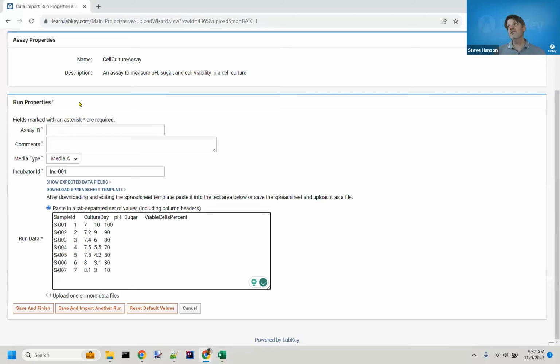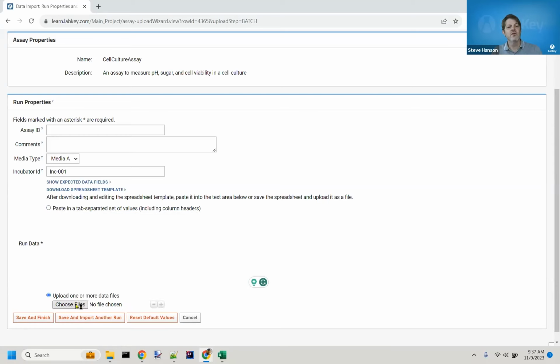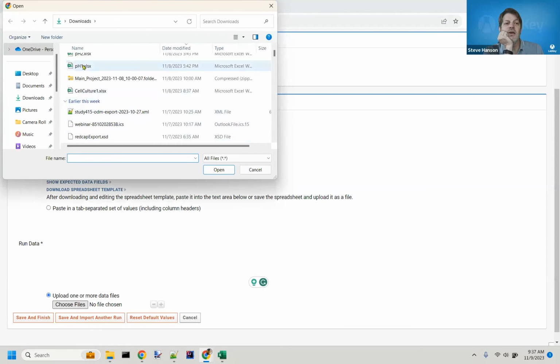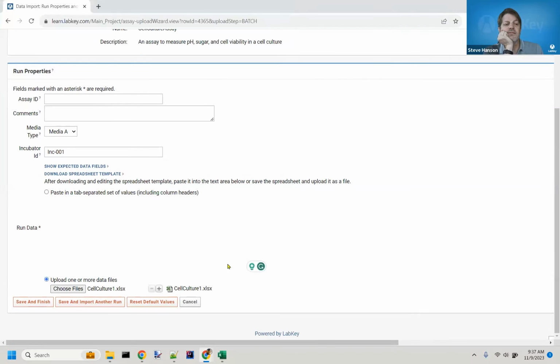And in fact, this is just the kind of move people do when they have some weird file format, which maybe has a bunch of headers and then the table's offset. They'll copy and paste the offset table right into here. But let's not do that. Let's actually go point at the file. So I'm going to just point at that Excel file. And hopefully this will work.